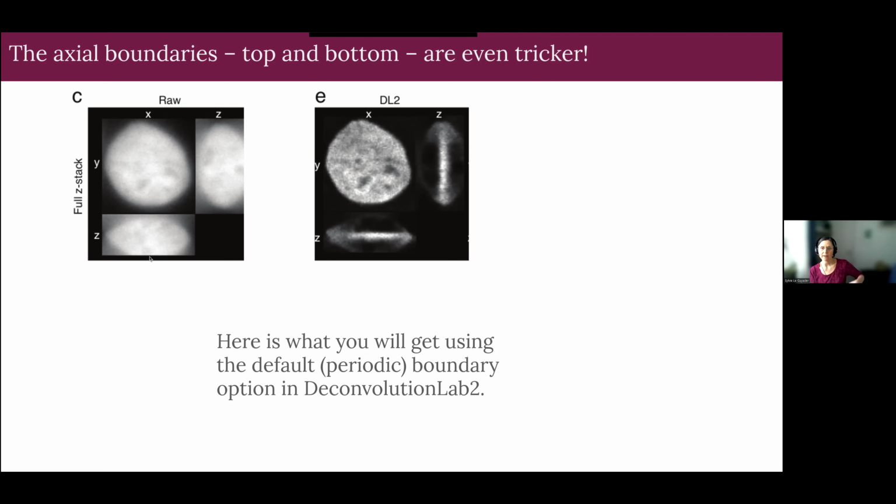When you say padded, you mean that we should start the Z-stack well before the object and stop well after. Is that what you mean? That's one way to do it. Yes, I think that's the standard procedure. If you don't, you will end up with something like this. For example, in Deconvolution Lab 2, if you use the default settings, the nucleus will be just a thin line in the middle. It looks very weird.